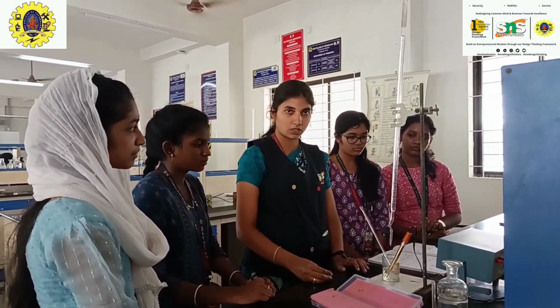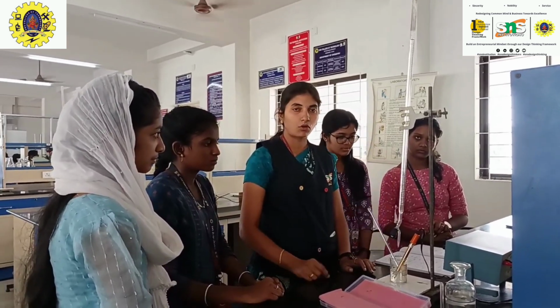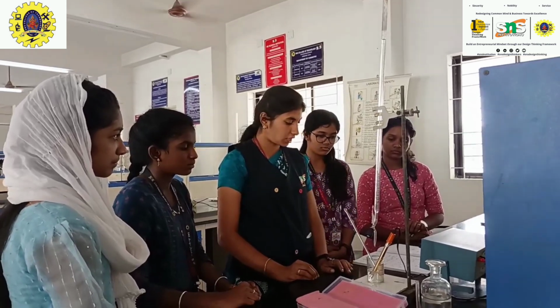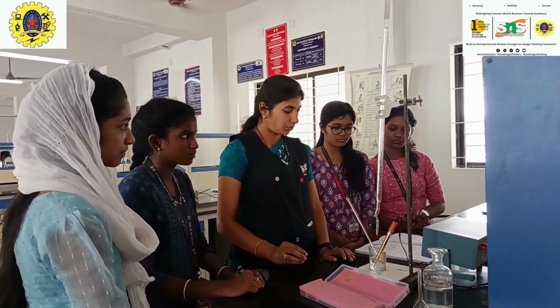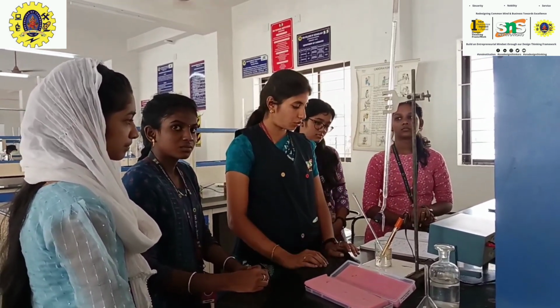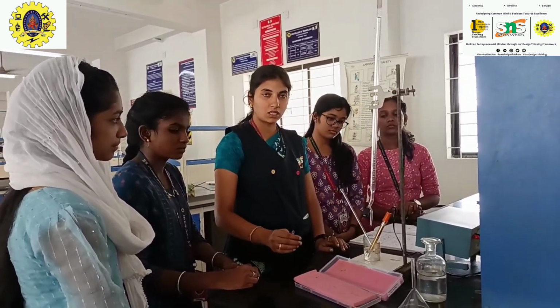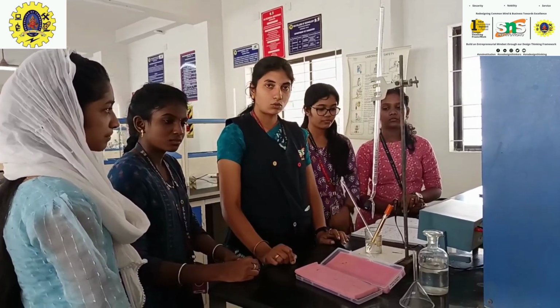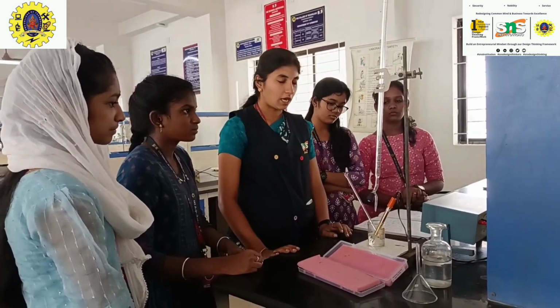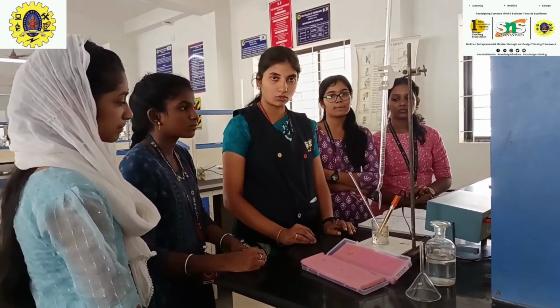Acetic acid plus sodium hydroxide gives sodium acetate plus water, and HCl plus NaOH neutralizes to give NaCl plus H2O. The first neutralization is of HCl and the second is of acetic acid. Hence sodium acetate, a strong electrolyte, increases the conductance.